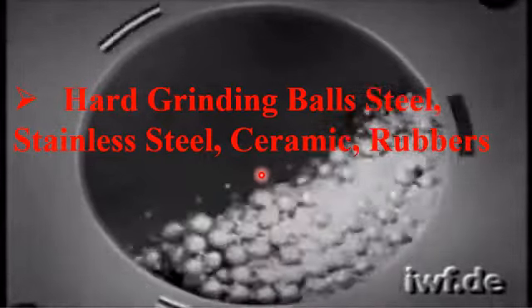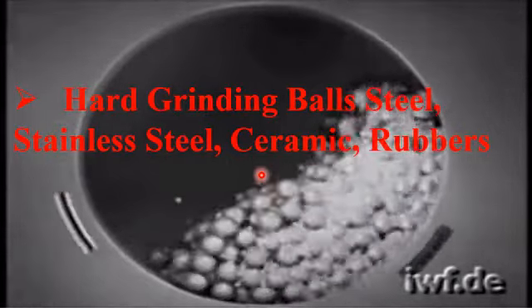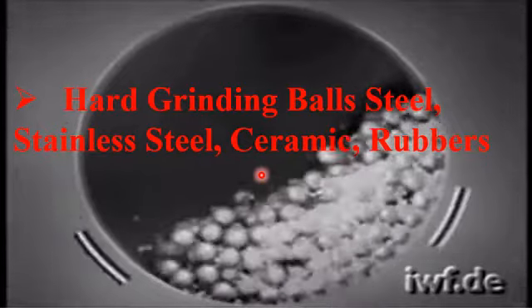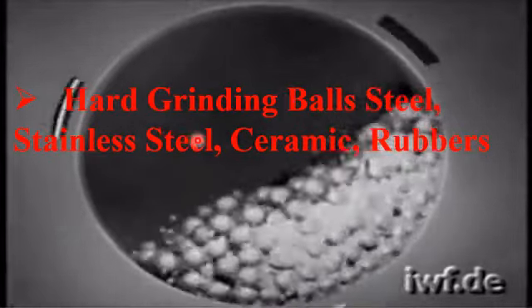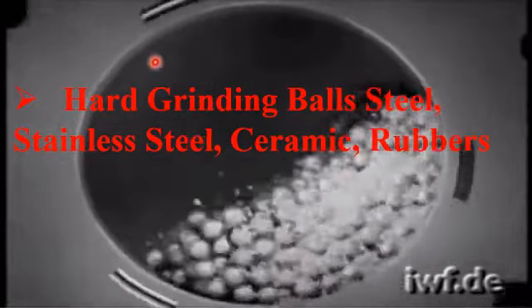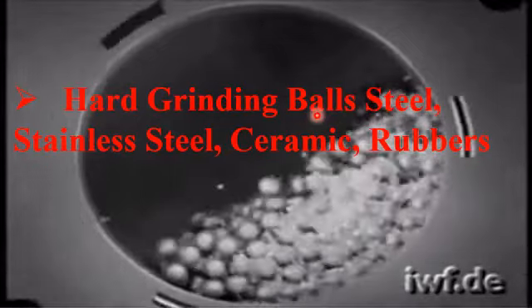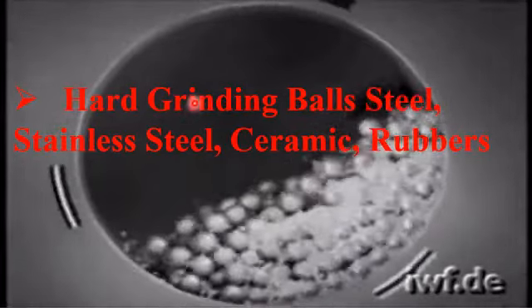They are also used to crush a bulk material into fine nanoparticles. Basically, in a ball milling machine, the hard grinding balls, in accordance with the rotation of this hollow drum, are responsible for converting a bulk material into a nanomaterial.